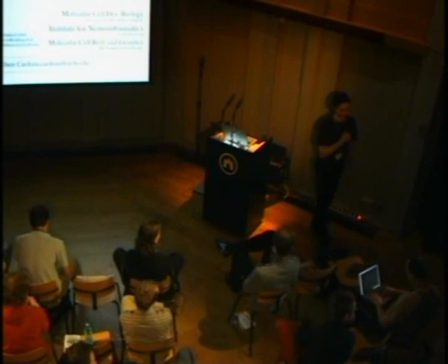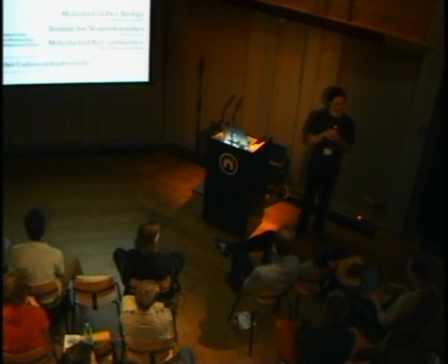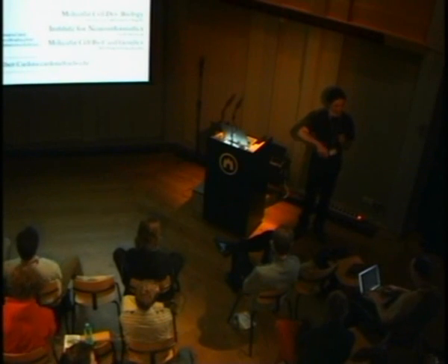This is actually stuff I'm working on at the moment. But it's not too difficult, because with the same algorithm, you can detect which parts of the curves are similar to which contours in the next section. So then you can decide rules for saying, okay, this part of the curve will correspond to this profile in the next section, and this other half will go to the next one. And you can nicely do it. But this is what I'm working on, and I need at least another month to finish it.